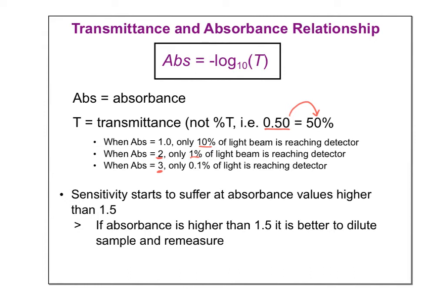And then just another reminder, we cannot directly measure absorbance, right? Because that's looking at what the particles are essentially pulling in from the light. But what the colorimeter does is it actually measures percent of transmittance, because we know what's coming in, and then it goes through the sample. We know what's coming out. It's hitting that detector. So we can measure transmittance. And when the LabQuest gives you an absorbance, that is actually the LabQuest doing a calculation for you. So it measures the transmittance directly and then calculates the absorbance for you, and that's the readout that we're getting.